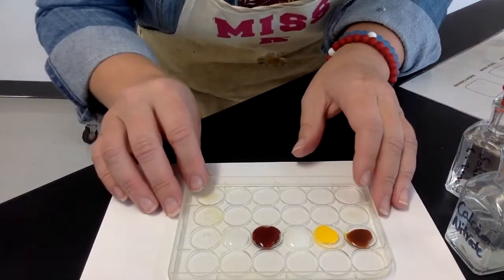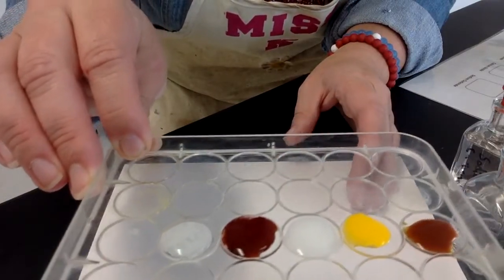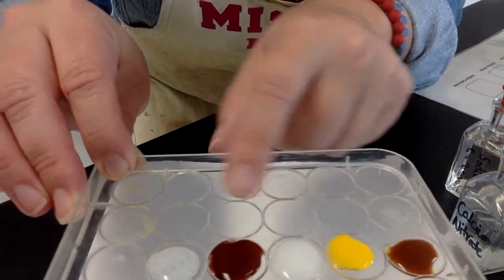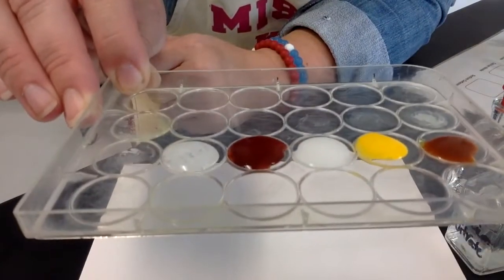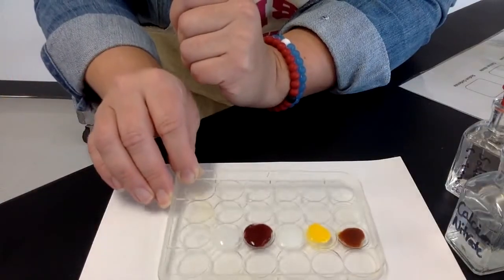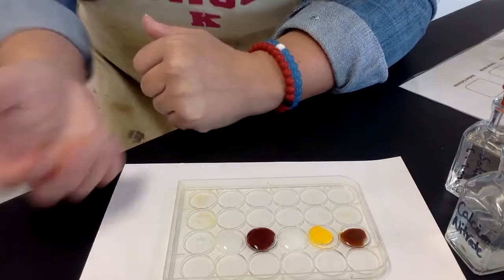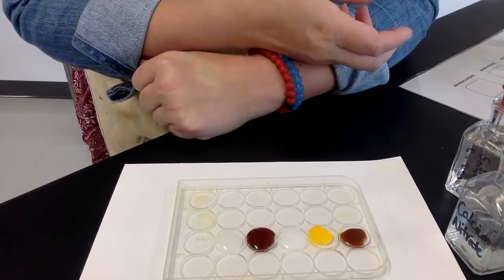Okay, so this one you can see, let me hold it up a little bit there. This one is still white, but see how it's different than this one, which is very opaque. This one is more marbly, just showing you a little bit of difference between those precipitates when we're identifying them, but it definitely looks a little bit different. So what you saw here is 5 different precipitates from different solutions that we started with.